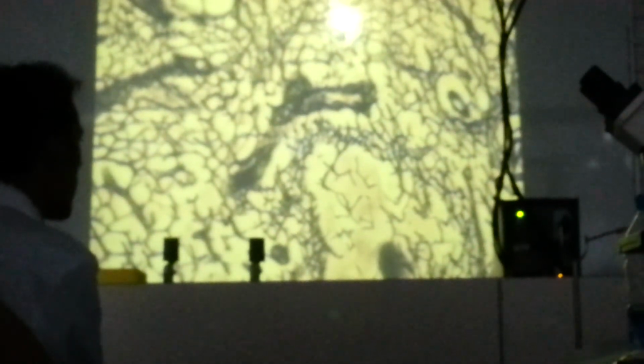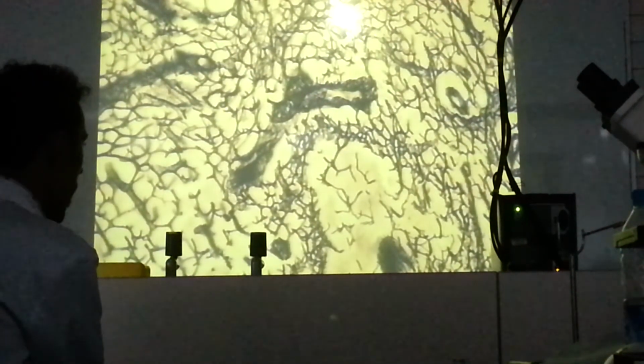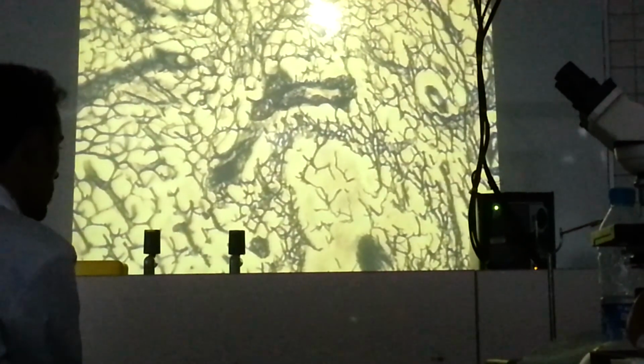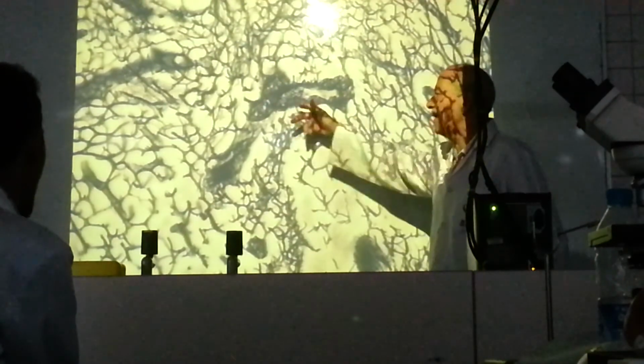This is another easy section. Okay. Tell me the name. Reticular. Reticular what? Connective tissue. Stained by silver, because reticular fibers have to be demonstrated by silver stain. They do not appear in hematoxylin and eosin stain. Number two, a network of anastomosing reticular cells and fibers.